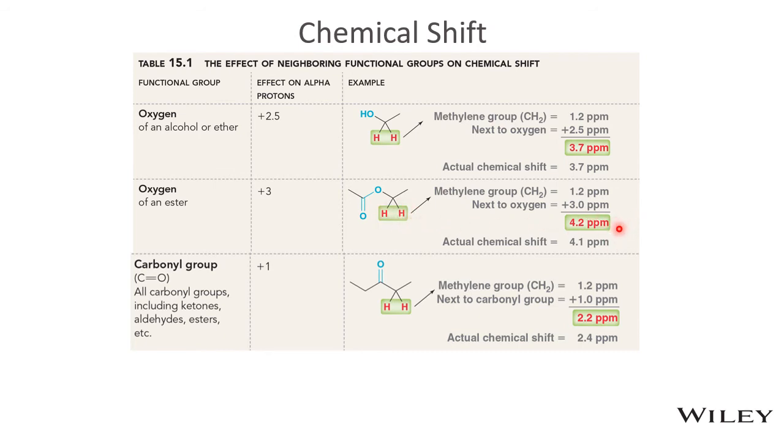And in fact, if we were to take this molecule and run it in the NMR, we would see the actual chemical shift around 4.1. So these are very close.